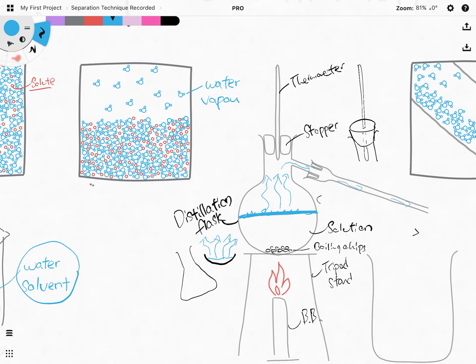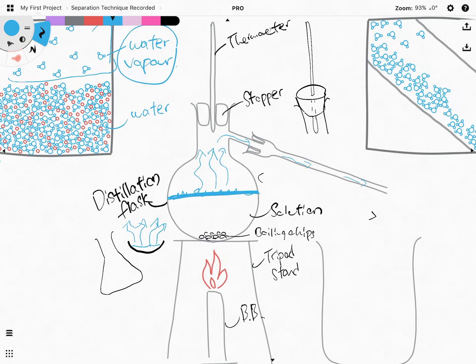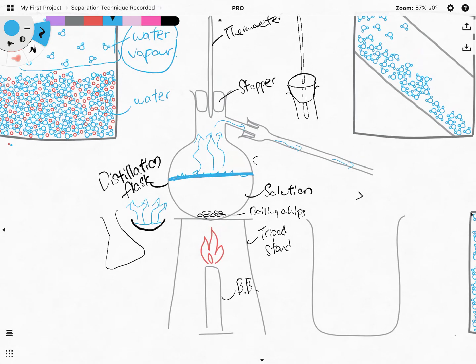Water vapor, as you already know, is the gaseous state of water. This is the liquid form of water. That's great. You see, in a sense, I have separated out the solvent from the solute. But I have a bit of a problem. It is in gaseous state. And when it's in gaseous state, and because you know hot things rise, it rises to the top.